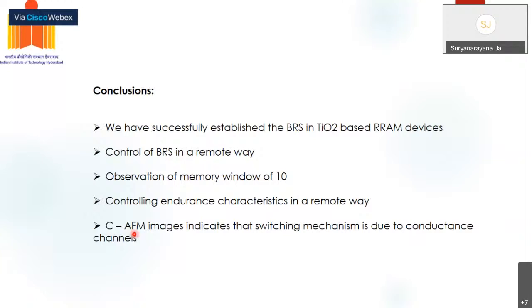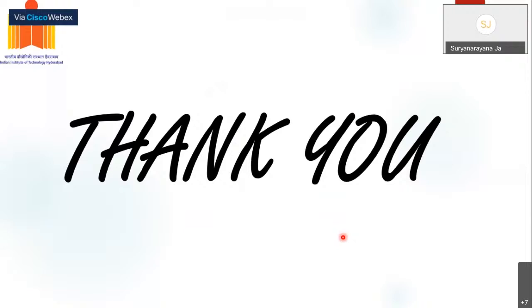Finally, the CAFM images indicate that the switching mechanism is due to conducting channels, and it also proves that the conduction channel mechanism that we have obtained is because of oxygen defects. Okay, with this, I would like to thank everyone for your kind attention, and if you have any questions, feel free to ask.